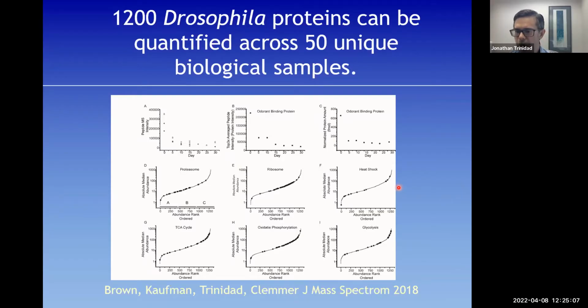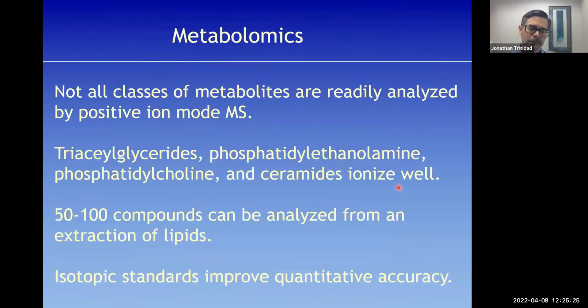So, in full disclosure, proteomics is not where genomics is in terms of the depth of sequencing coverage, but the field and the instrumentation has certainly made really good progress over the last 5 or so years.